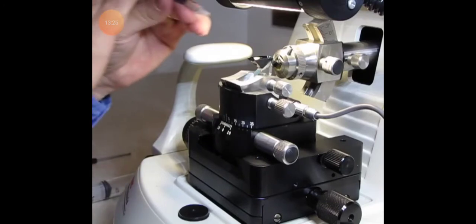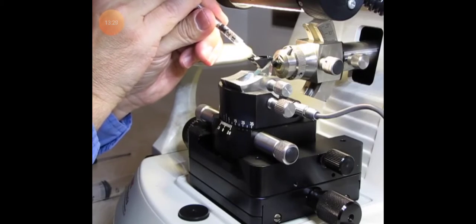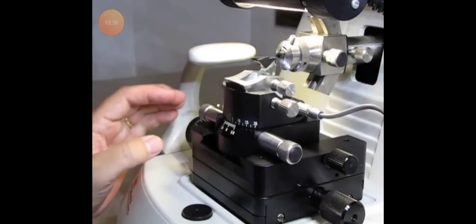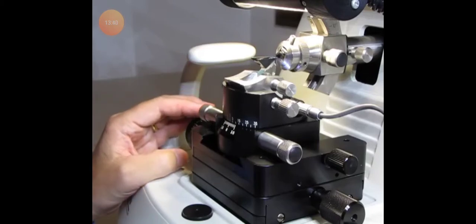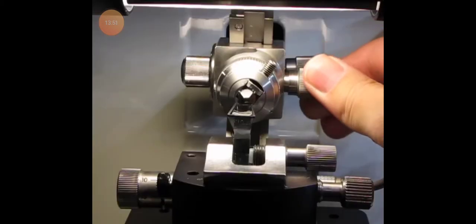This is the ultramicrotome. What you see, this instrument is the ultramicrotome. Place it into the water, and you'll need to watch through the binoculars or the TV viewing screen. So here a microscope will be attached to this microtome. You'll notice that the block face is a little crooked compared to the knife edge. Only then we will be able to adjust the thickness, the trough, etc. Which will rotate that, and then allows you to get the block face parallel to the knife edge. Now you notice these are all adjustments being done.